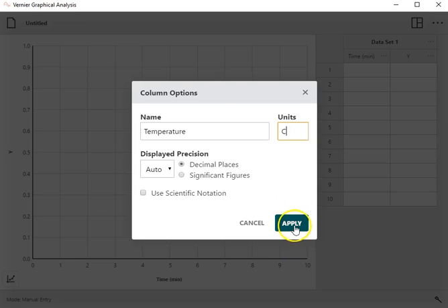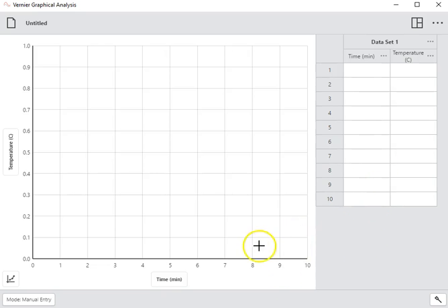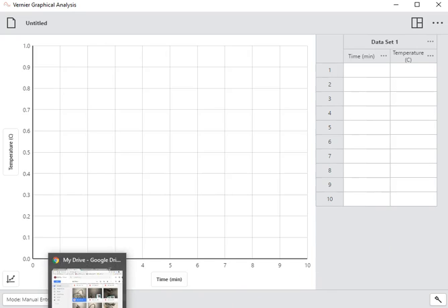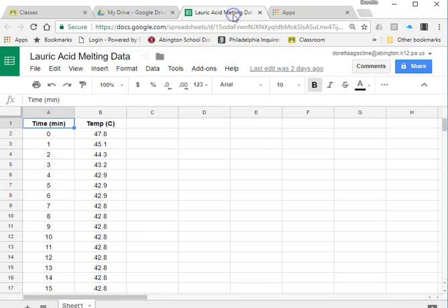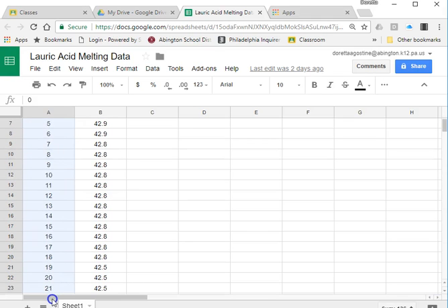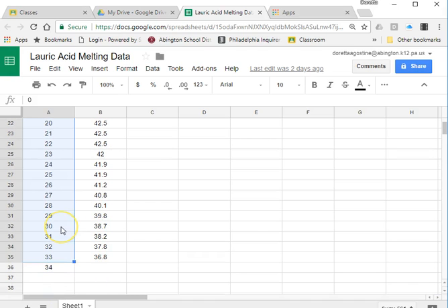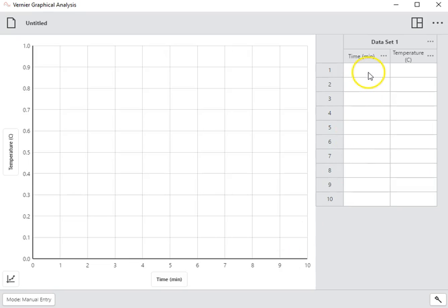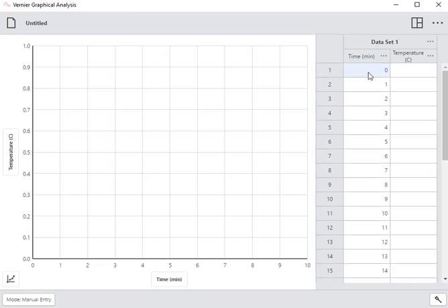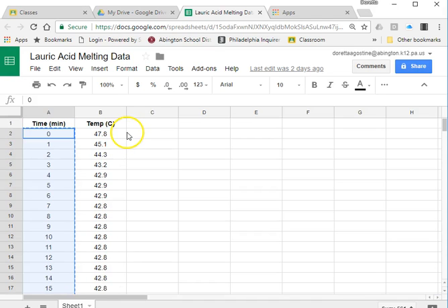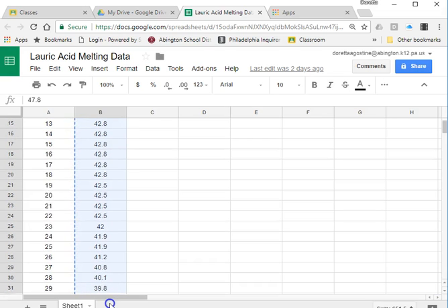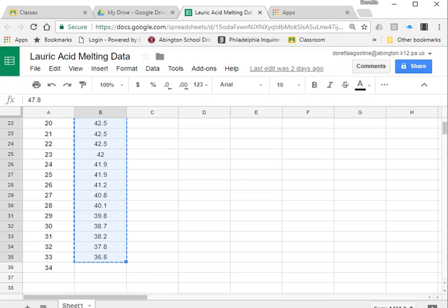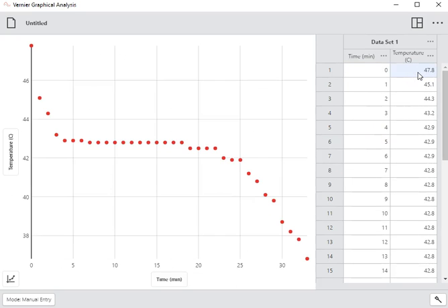Since it doesn't give me superscripts, I'm just going to use a capital C for degrees C. Then I'm going to pull up some data I have. I'll scroll down through the time data to the end, copy it, go back and paste it into the time column. Then I'll go to the temperature column, scroll down, and paste the temperature data in. You'll see that automatically gives me a pretty beautiful curve.